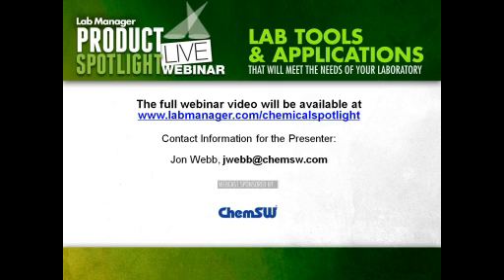Correct. But just quickly following up on that, the expiration date doesn't really tell you when a chemical has degraded, right? How do you recommend people going in once in a while and actually testing the integrity of that chemical, and how do you approach that problem of degradation? Yeah, absolutely, and I think retesting against the standard is always a best practice.